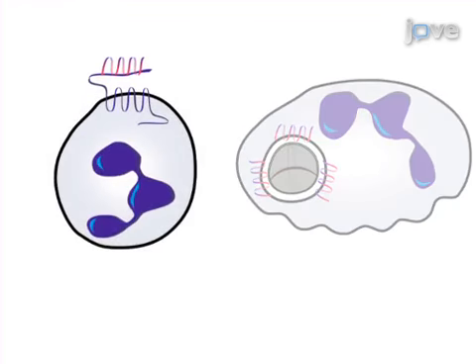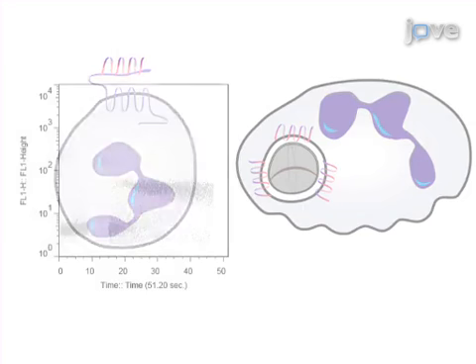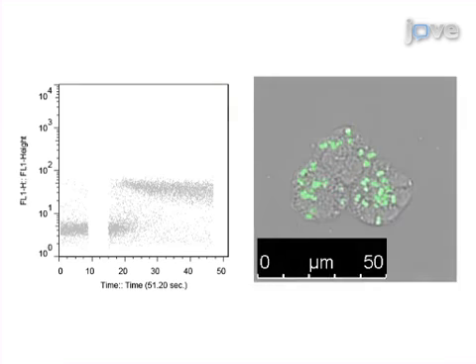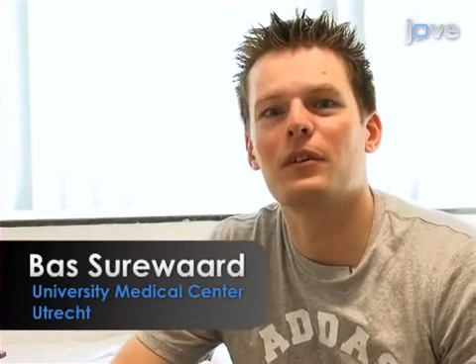Ultimately, activation of the neutrophils by PSM stimulation can be monitored by flow cytometry, and expression of GFP by the phagocytosed bacteria can be analyzed by fluorescence microscopy. By this method you can study the effects of staphylococcal phenol-soluble modulins on neutrophils. Of course, this method can be applied to many other cell types, stimuli and antagonists.